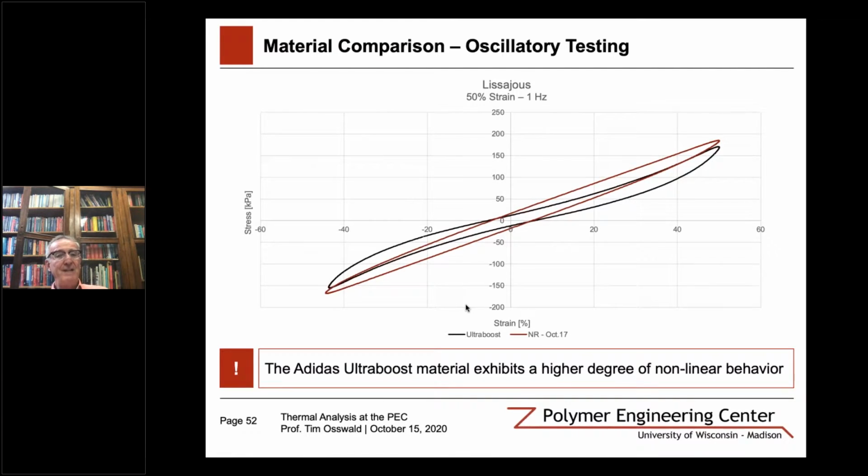But this is exciting, and the thing is, to be able to take these large rubber samples and deform them to 50, maybe 100%, you actually need a lot of force. So this is where the 500 newtons of the Eplexor equipment really come into the picture to be able to do nonlinear viscoelastic testing. The higher you go into the nonlinear domain, the higher forces you require.